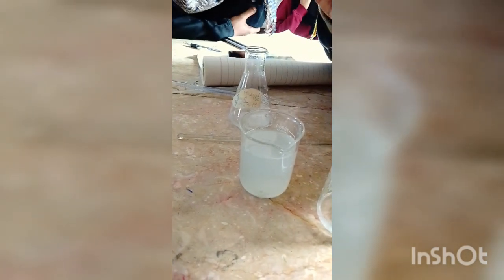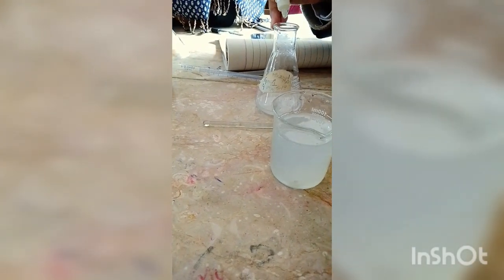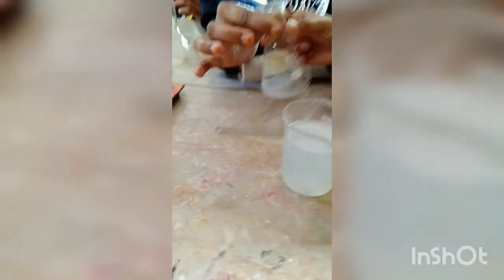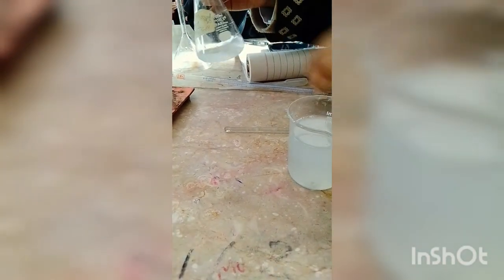In the beaker we have the solution. We already transferred the solution into the beaker. Now we are adding the indicator — phenolphthalein indicator — just add one or two drops. Shake it a little bit.